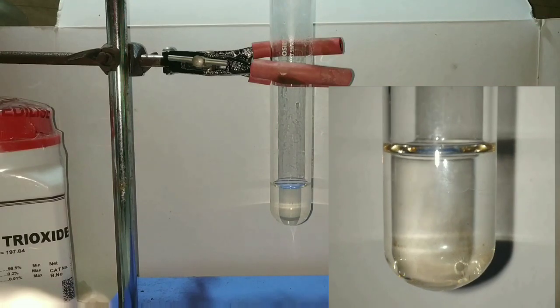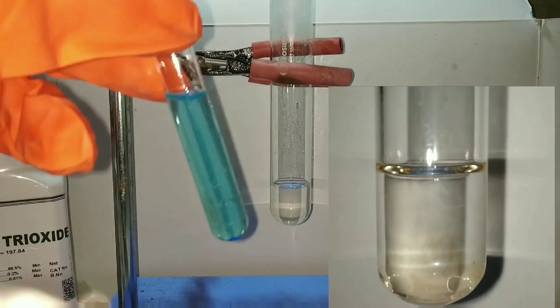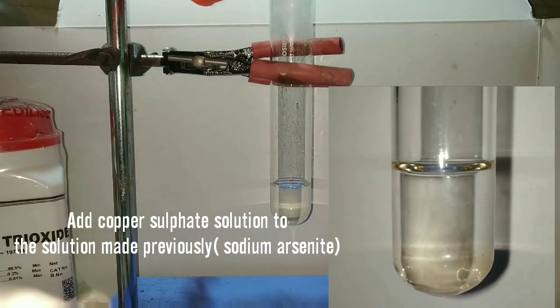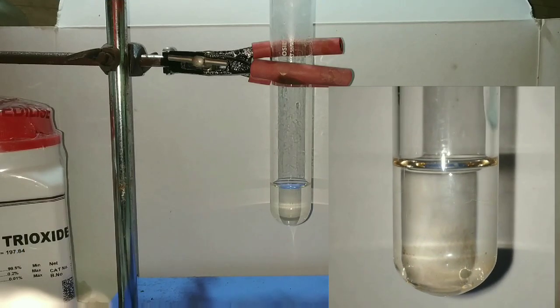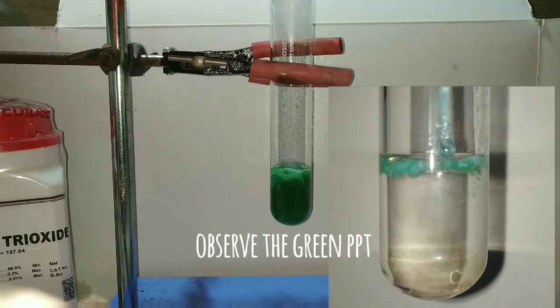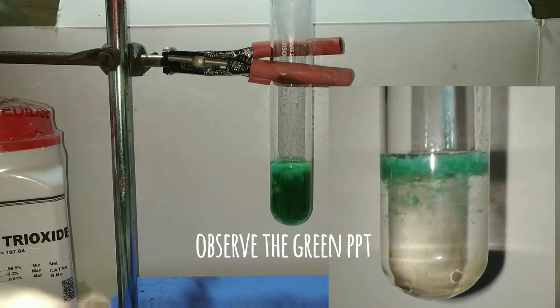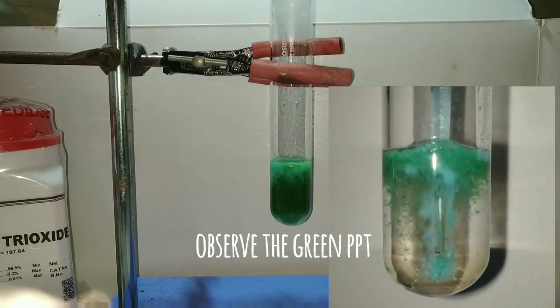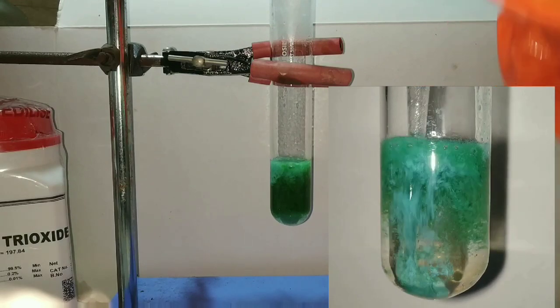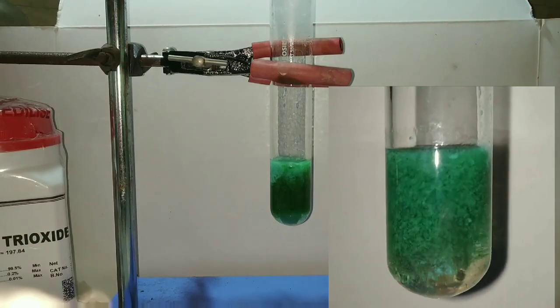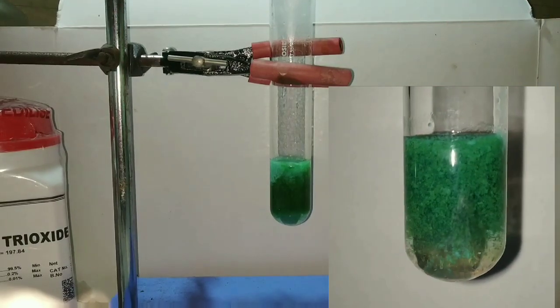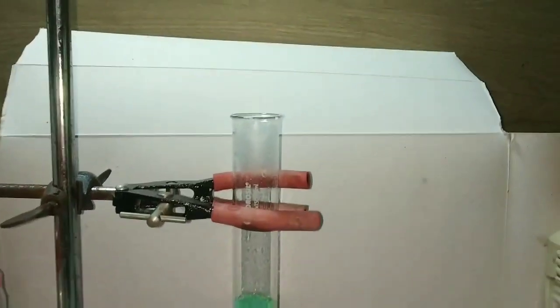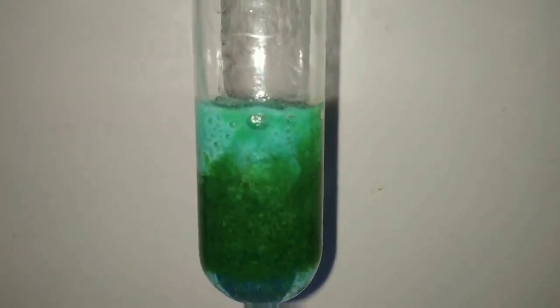Here we will be preparing the Scheele's green. First of all we take the sodium arsenite solution prepared earlier and add the copper sulfate solution. You can see that as soon as I add the copper sulfate there is formation of a beautiful green precipitate and this green precipitate is the copper arsenite. And this was the dye used for painting walls previously but it has been banned now because of the toxicity produced by the arsenic.